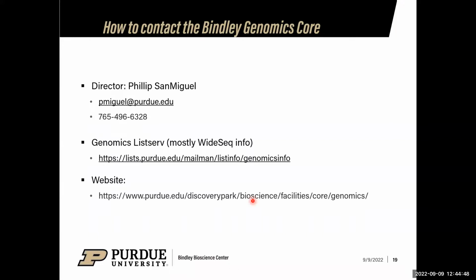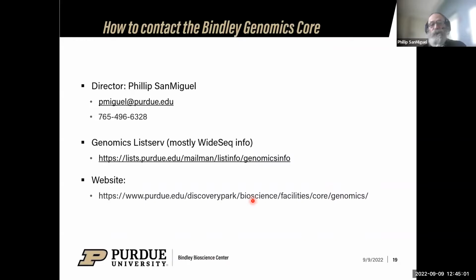Philip, I've got a couple of questions in the chat. I'll start with, have you sequenced cDNA? Yes. There's a couple of different ways you can go with cDNA. We've done cDNA. Now, the thing is, you're going to have to actually do double-stranded cDNA, I think.